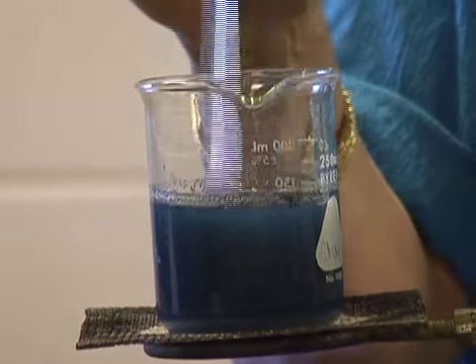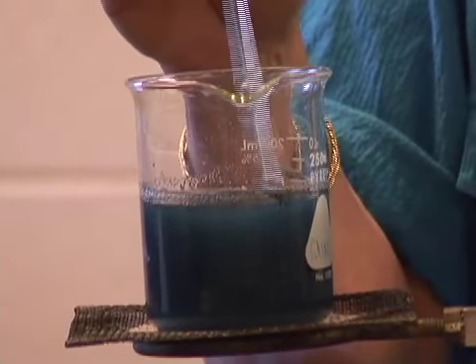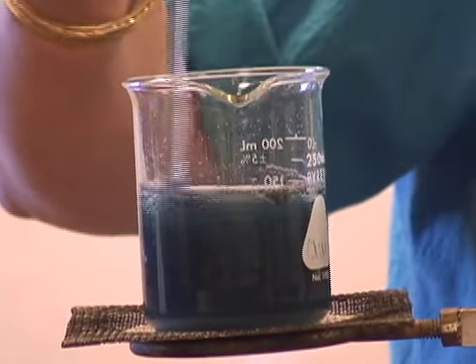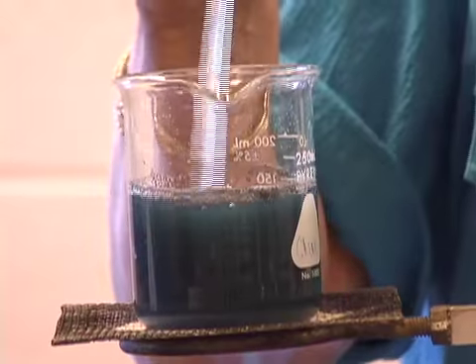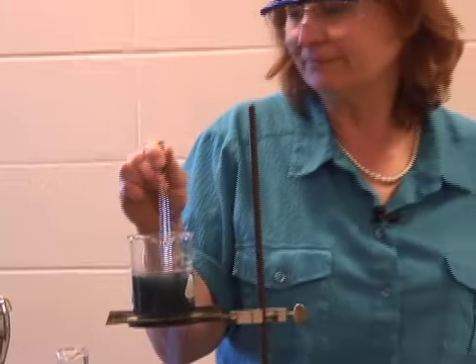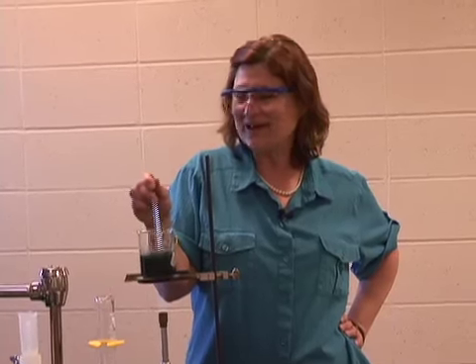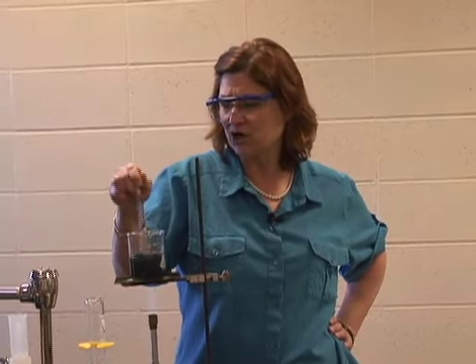Now, when we're waiting, sometimes, if we were actually in the lab, you could be working on some of the problems that are given in the lab. And as you can see here, this solution is getting darker and darker as more and more of the copper 2 hydroxide is forming copper 2 oxide. It's a good sign. We like to see that. It's going as planned. Oh my, it's getting darker and darker.